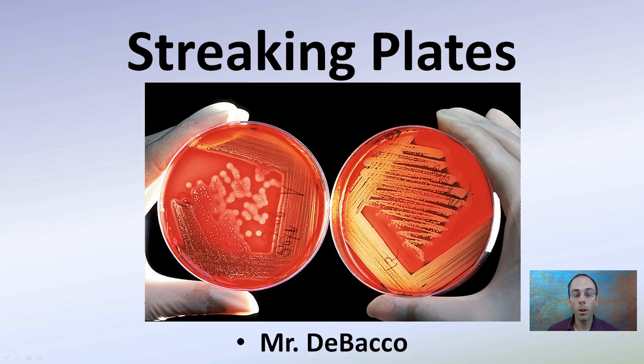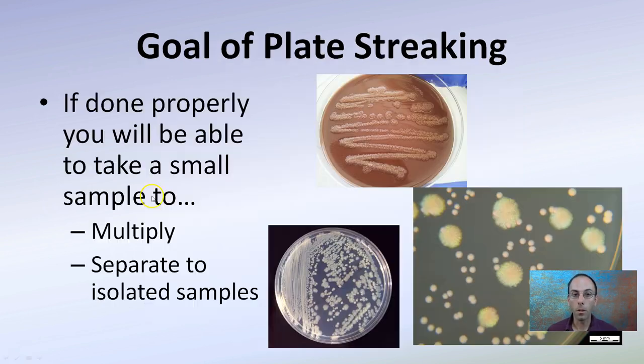Here I'm going to go over a proper technique to streak plates so you get beautiful plates when you're trying to isolate and or grow bacteria. The goal of plate streaking, if done properly, is to take a small sample and either multiply it or separate it into isolated samples. Here we're looking at multiplying it, and here we're looking at trying to isolate individual colonies. You might be able to pick one of these colonies and then go through and multiply that on a separate plate. That's the goal of plate streaking.